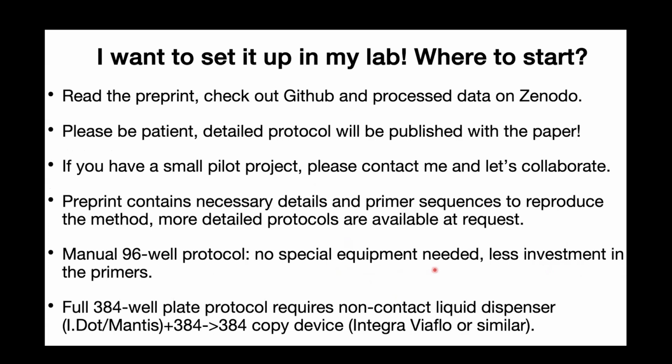This is my last slide. If you want to set it up in your lab, where to start? Because a lot of people ask me this question. First, there's a preprint which contains all the details. Check out the GitHub, and we also deposited processed data on Zenodo for all experiments. So you could try how it works on your machine and see if it will answer questions you have about your samples, maybe. We will publish a more detailed protocol with the paper.